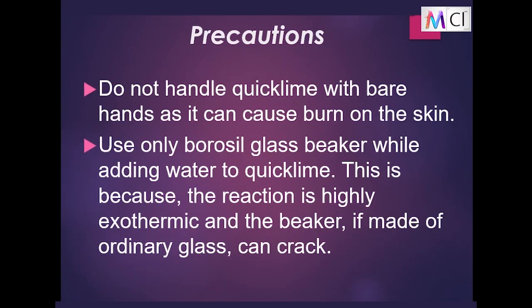Precautions. Do not handle quicklime with bare hands as it can cause burns on the skin. Use only a borosilicate glass beaker while adding water to quicklime. This is because the reaction is highly exothermic and the beaker, if made of ordinary glass, can crack.